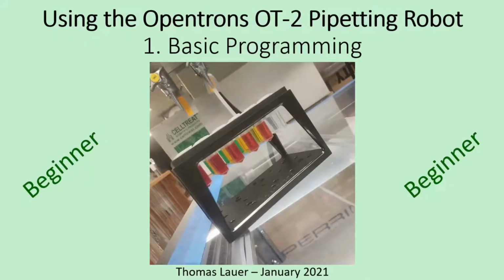Alrighty, let's see here. So, welcome back. This is now chapter 1 of using the Opentrons OT-2 Pipetting robot.